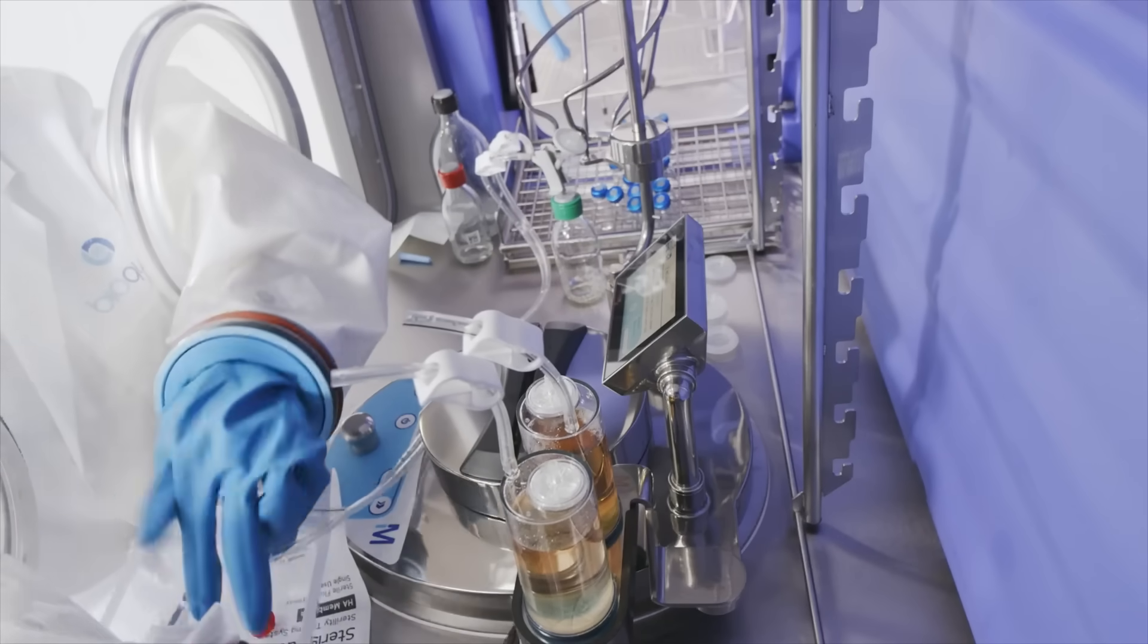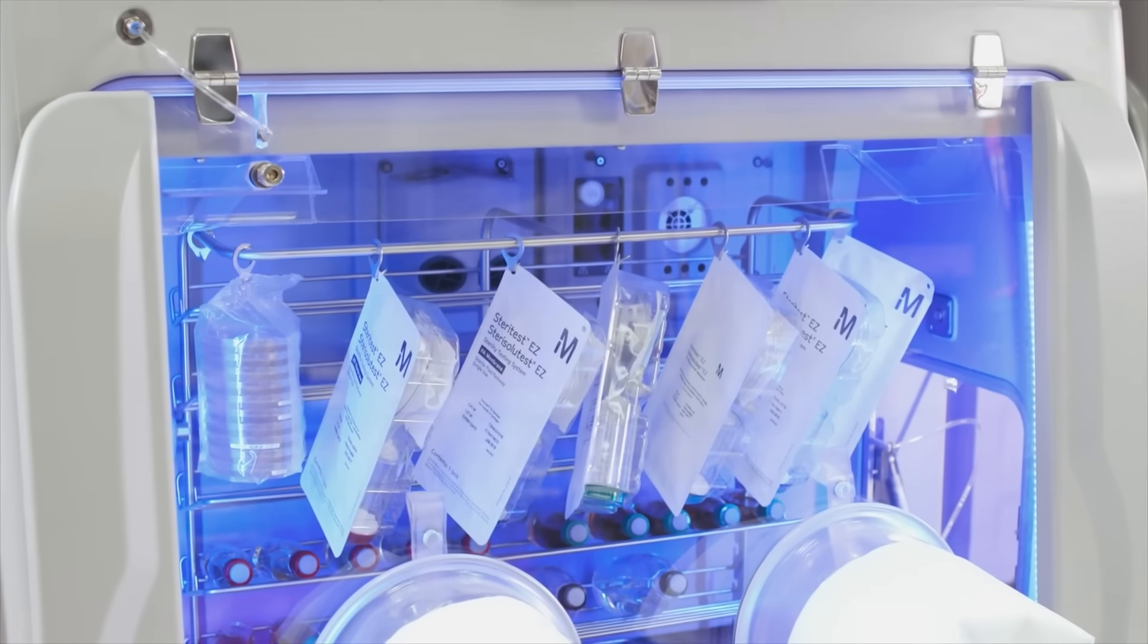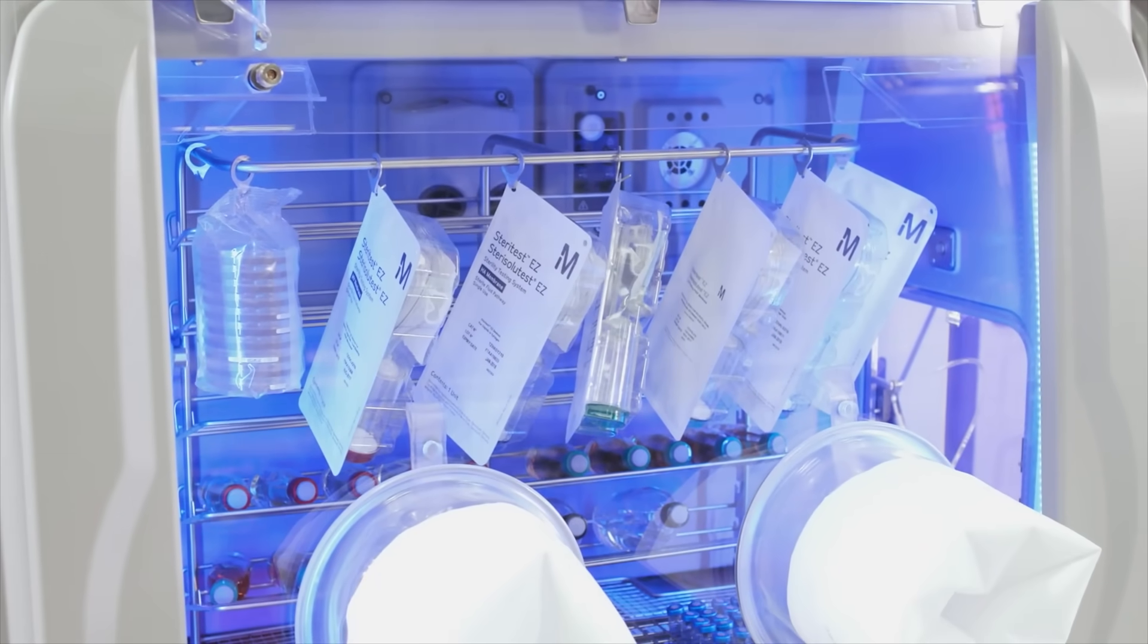The BioQuell Cube provides its unique capabilities in nearly every way, from order to installation and validation. It can be ready for use in as little as 12 to 16 weeks from date of order.